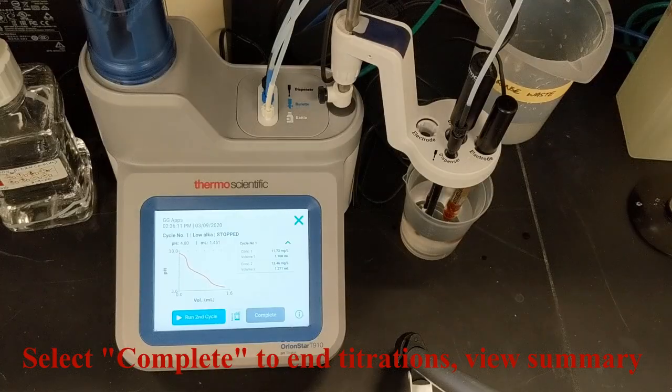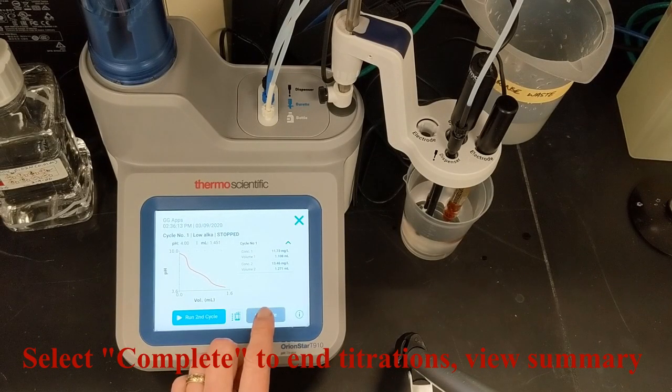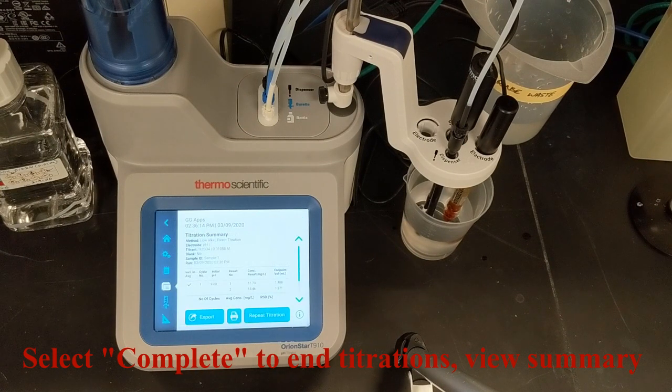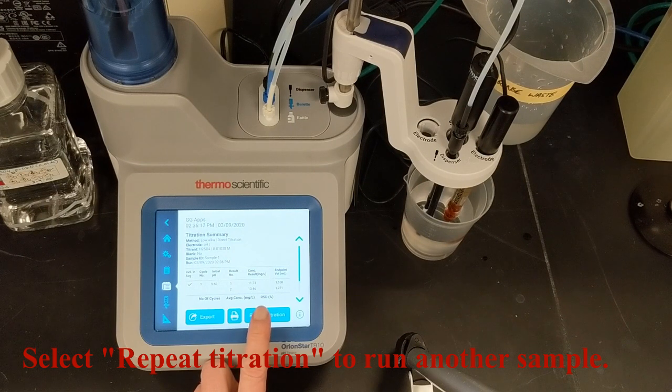I'm done with this sample, so I select complete, which shows me the summary screen. And I touch repeat titration to run another sample, bringing me back to the titration pre-check screen.